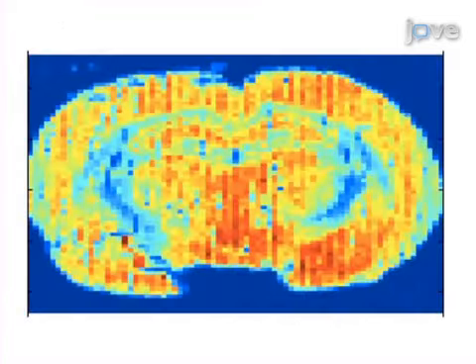The results show that there are distinct distributions of lipids in rat brain tissues between the gray and white matter based on the mass spectrometry images of selected lipid ions. Though this method can provide insights into the chemical distributions in biological tissues, it can also be used for a variety of other systems, including thin-layer chromatography plates, mineral surface reactions, and marine algae.